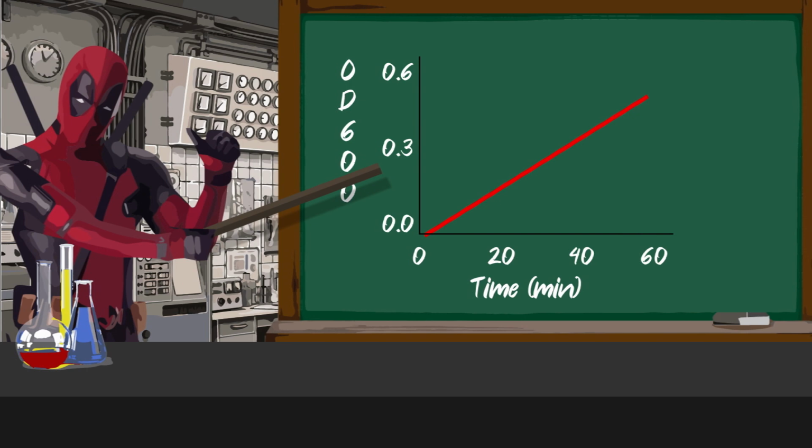Note: before the cells can be induced, the OD600 measurements will measure the absorbance of the culture to make sure the cells are in the optimal growth phase, which is normally in the range of 0.6 to 1. Once induced, the cells will not reproduce quickly, and after centrifugation, the protein can be extracted from the cell pellet and protein purification can commence.